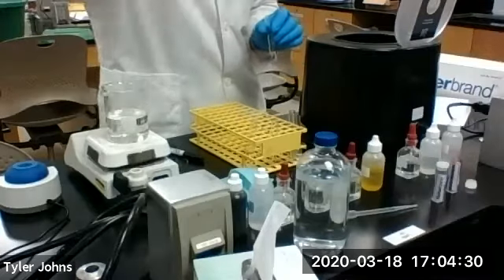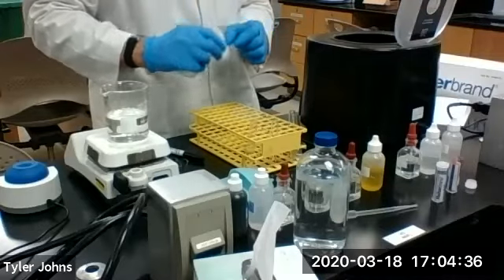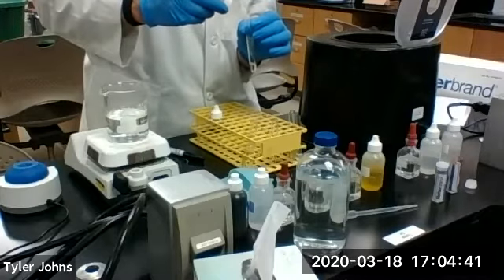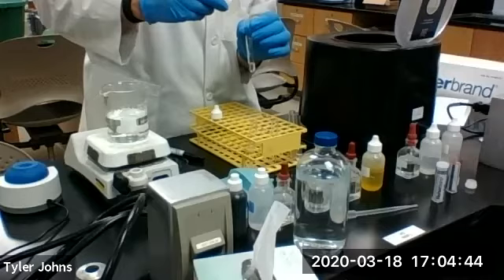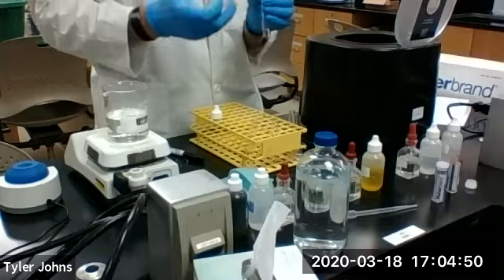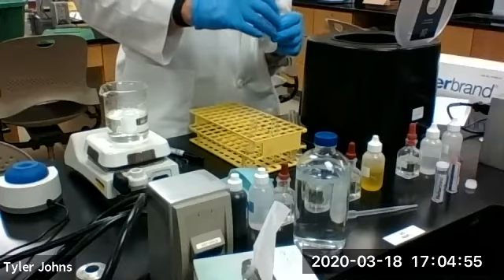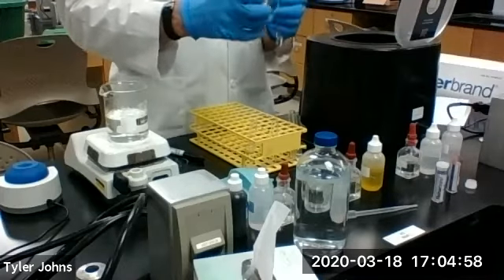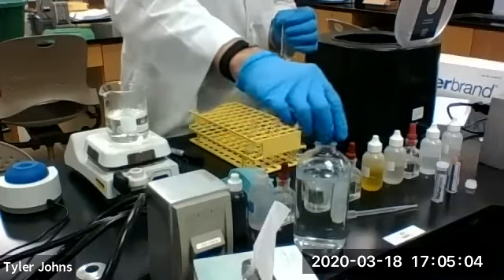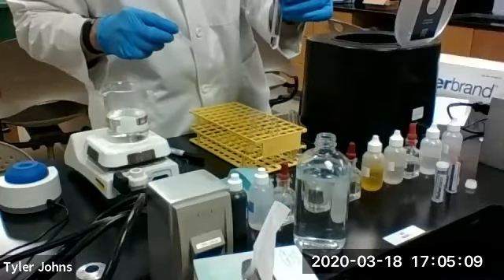We're going to be adding 5 drops of this. We will then add a little bit of water.